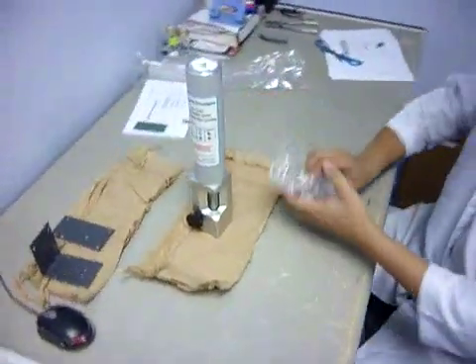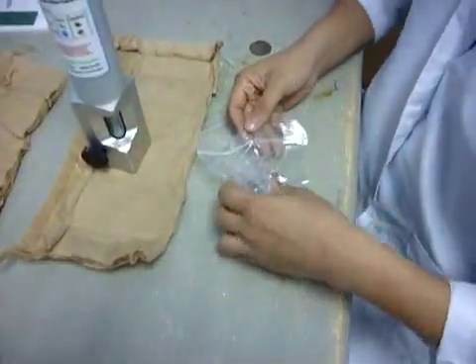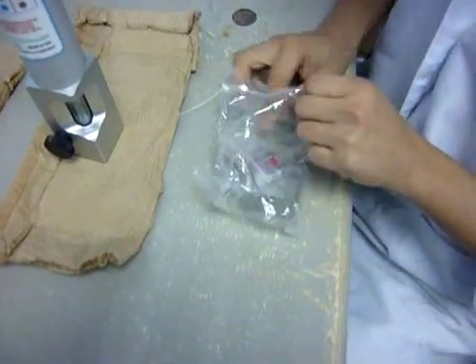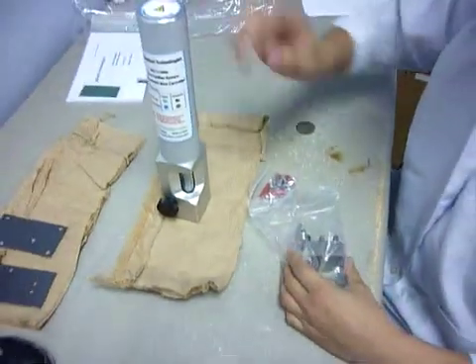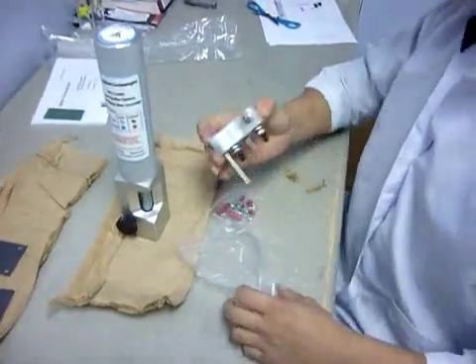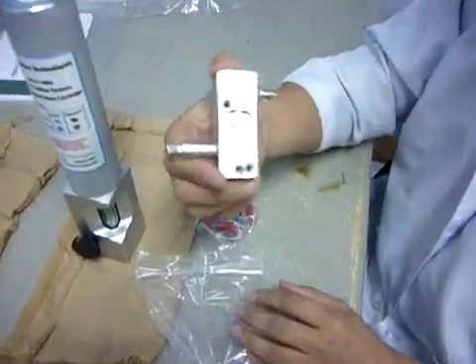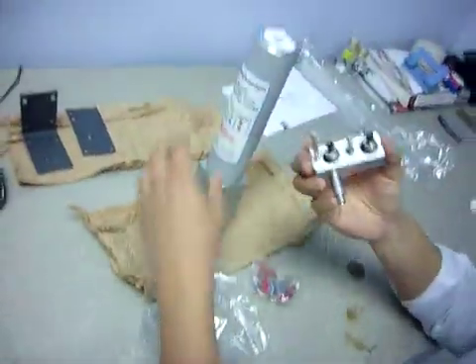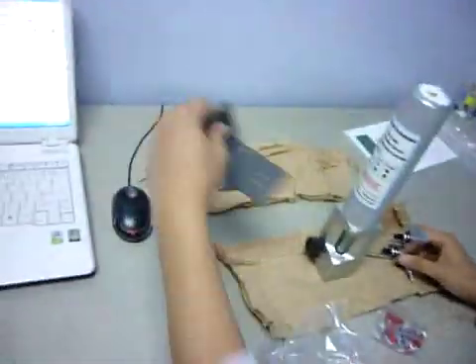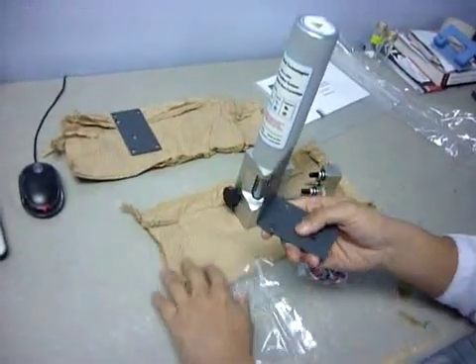Let me just unbox this. There are actually three main parts inside here. The first one is the gas purifier. The second part is this one, which is the base with nuts and the hardware for connection with the gas purifier. And then the other one is this one, which is the mounting base.